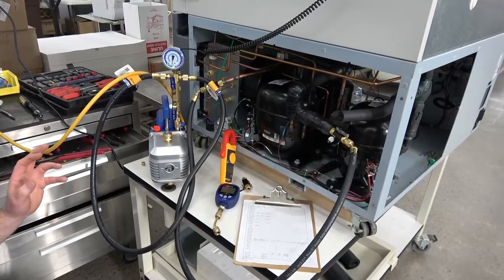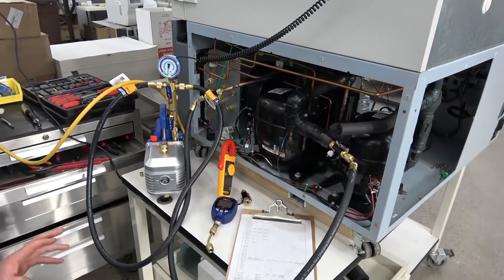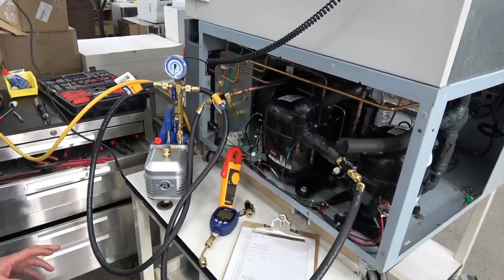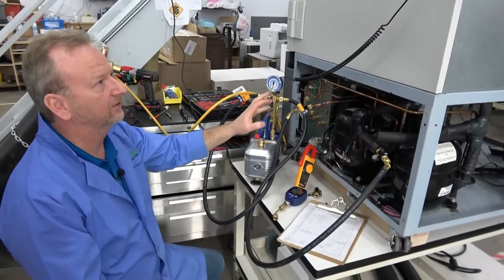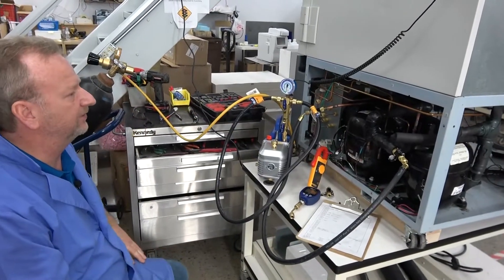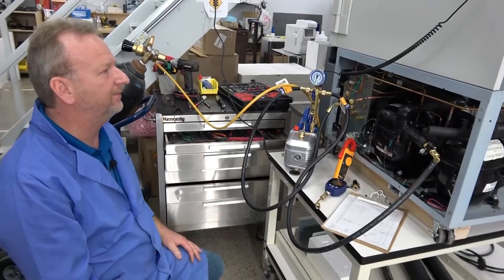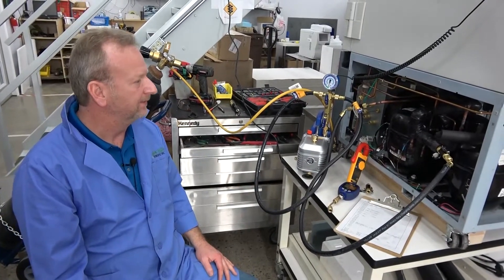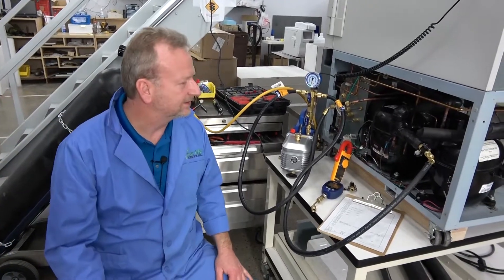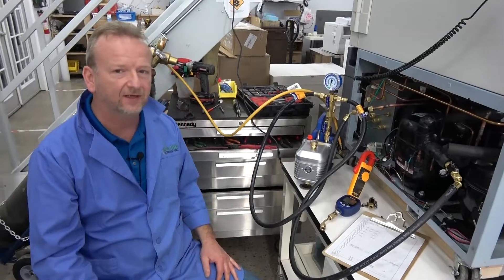That's why it's so difficult when a service tech goes out in the field trying to rush through and get it done in a day — there's no way to do a system like this properly in a day without having problems down the road. That's why an ultra-low freezer needs to come into a shop where the proper procedures can be carried out like this.